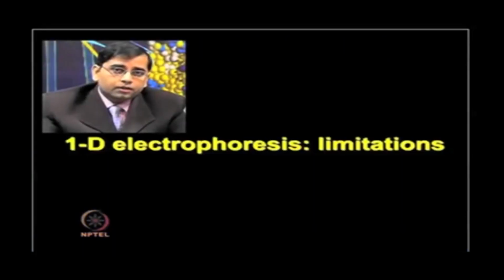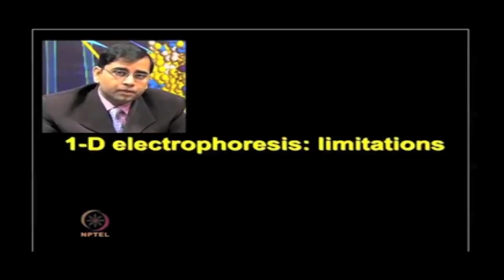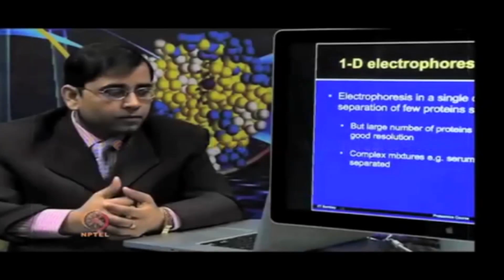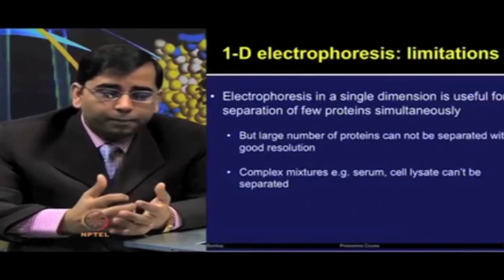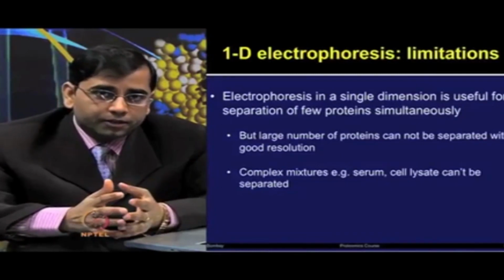However, one-dimensional electrophoresis has different limitations. You cannot separate your complex proteome, the complex protein samples. If you have thousands of proteins and you want to study them, then one-dimensional electrophoresis has limitations. One-dimensional electrophoresis is useful to separate a few proteins or a simple protein mixture.